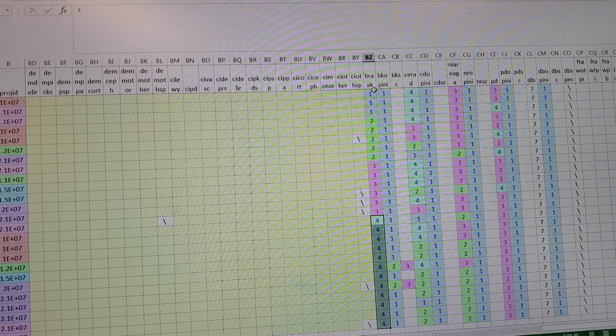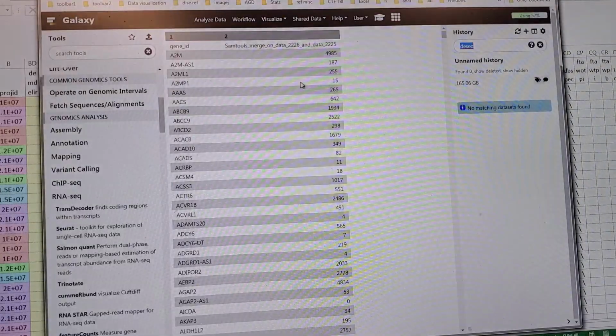So when you're doing the differential expression analysis, you would specify that all of these subjects are in one group, all of these are in another group, and all of these are in a different group. And then the differential expression software takes into account questions like, does this person just have a high number of A2M because they had more reads sequenced, or is it actually high expression?